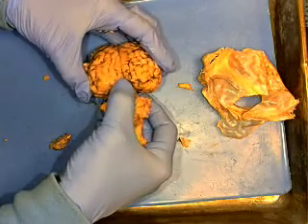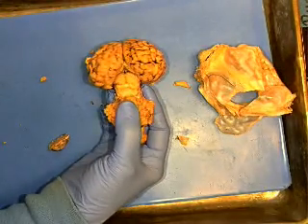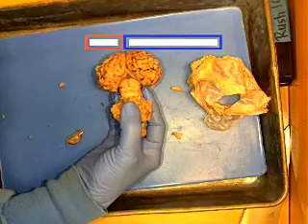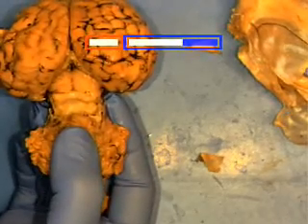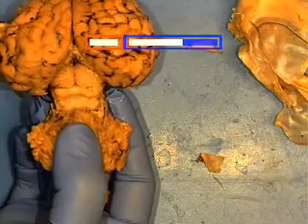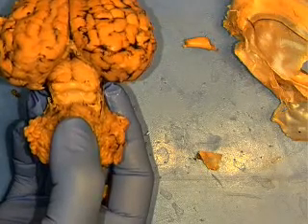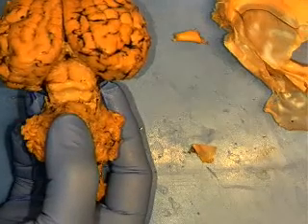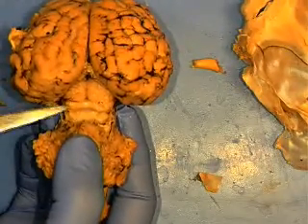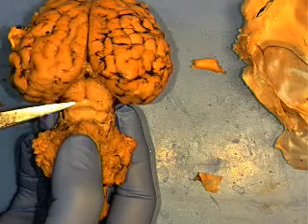If I pull down on the cerebellum and peep inside between, this is deep, I see a structure that's called the corpora quadrigemina. Why quadrigemina? Because there are four parts, the two superior colliculi and the two inferior colliculi. It almost looks like a little booty mooning you there. So the upper two structures are the superior colliculi, and the lower two are the inferior colliculi: the corpora quadrigemina.